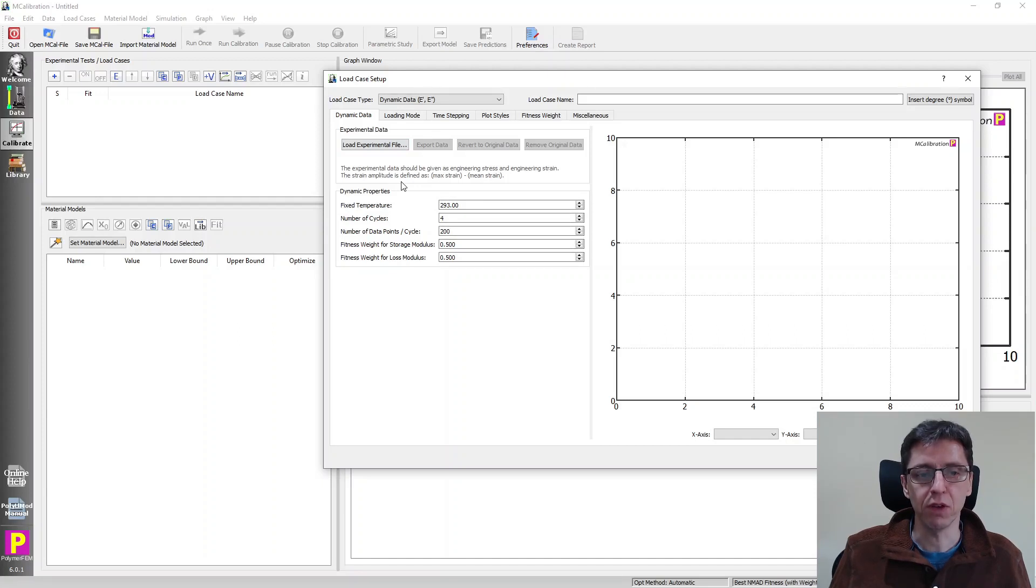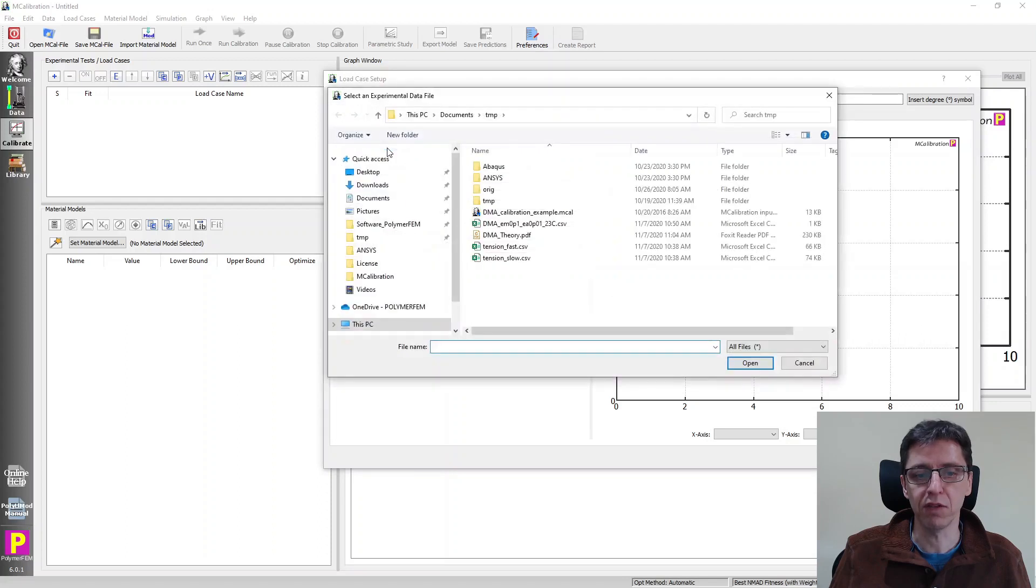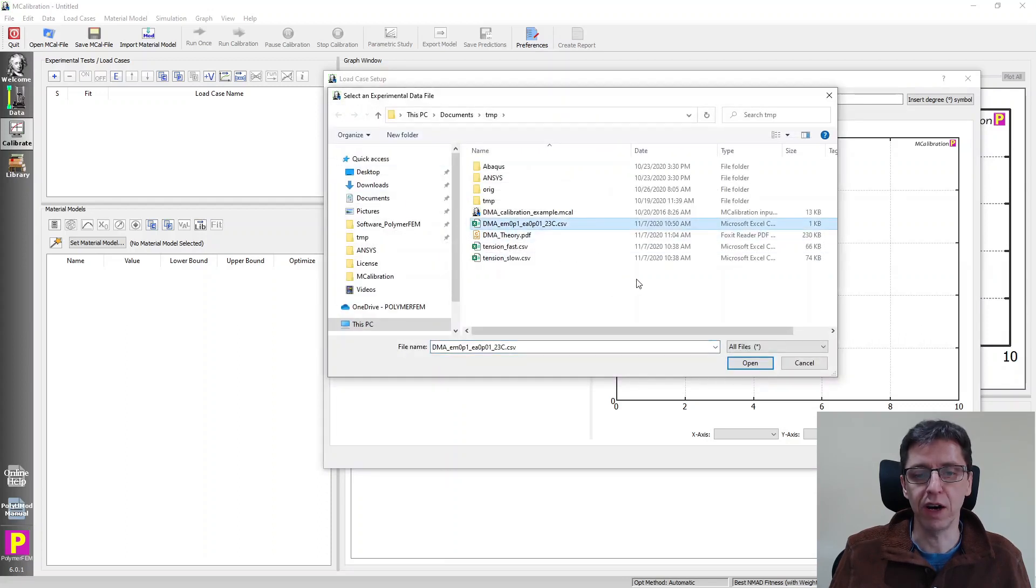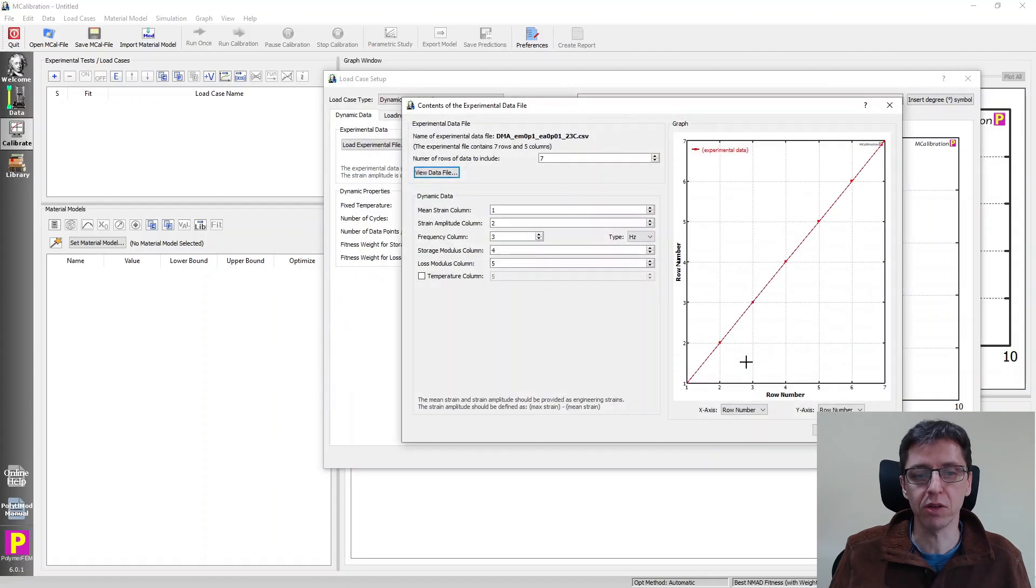The first thing we do is to load in our experimental data file by clicking on load experimental file, and then select this CSV file with the five columns that we just talked about.